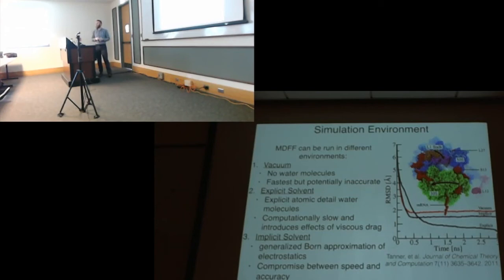So now with the new higher resolution driving structures, are there new additional restraints to it? So not so much new restraints, because as the maps are better, the map is sort of a constraint, so you're already getting the benefit of the higher resolution maps. So now, if you're looking at a 4 angstrom cryo-EM map, now you actually see side chains.